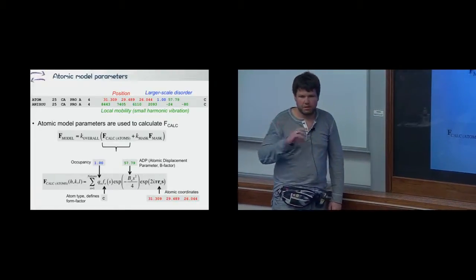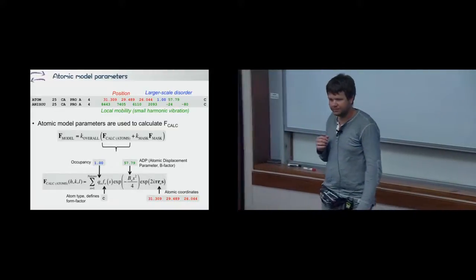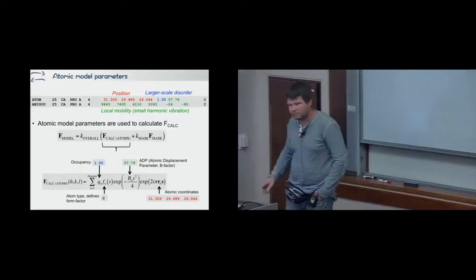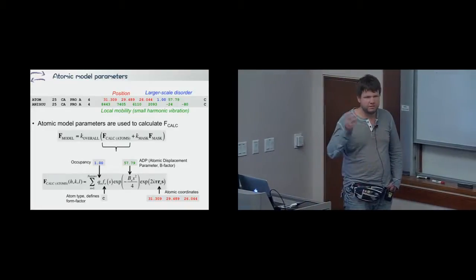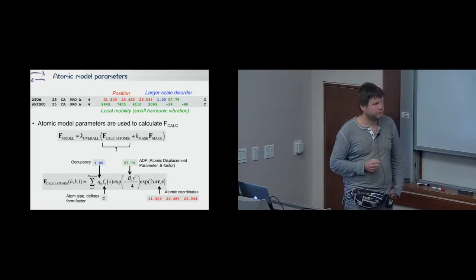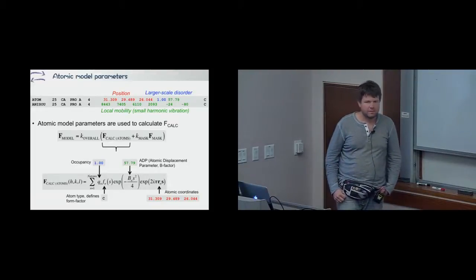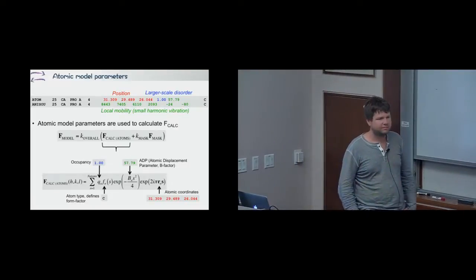They describe the harmonic vibration of atoms that vibrate anisotropically. Those are a measure of the principal axes of an ellipsoid rather than a sphere. So what does it tell you? It tells you the directionality of atomic vibrations. Instead of a sphere of an isotropic harmonic model, it tells you the directionality of atomic vibrations. It's the elements of the tensor that describe that. Can you give some sense out of the numbers? It's difficult to look at directly.